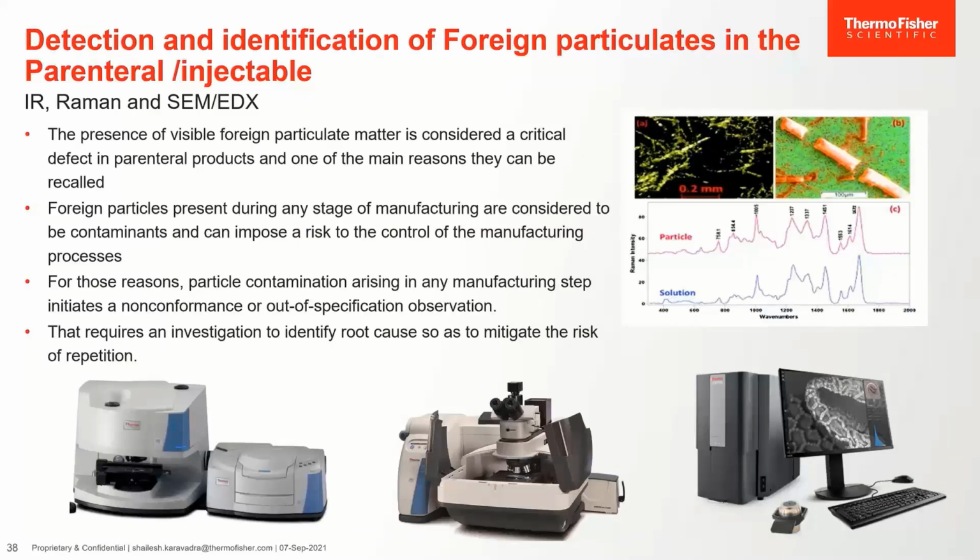Now moving to detection and identification of foreign particulates in liquid formulations, parenterals, or injectables. There are certain distinctions that must be made between intrinsic and extrinsic particles in the manufacturing.